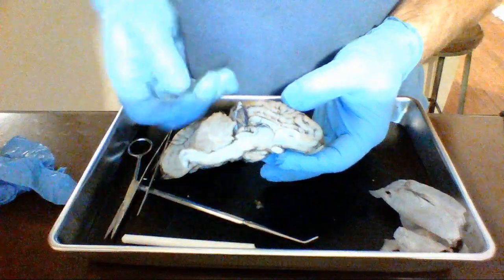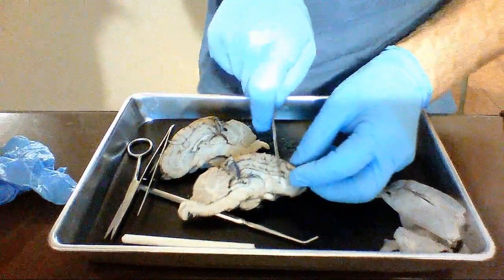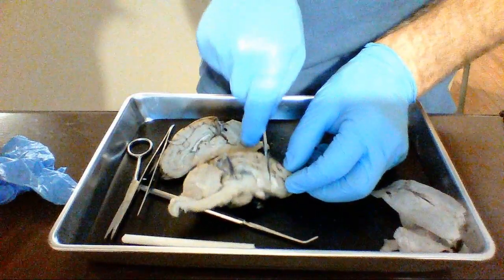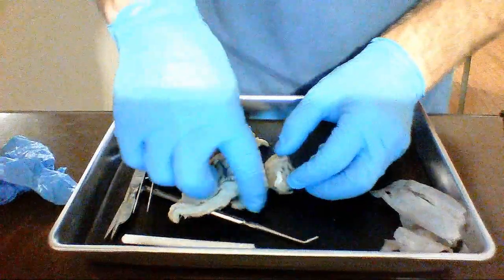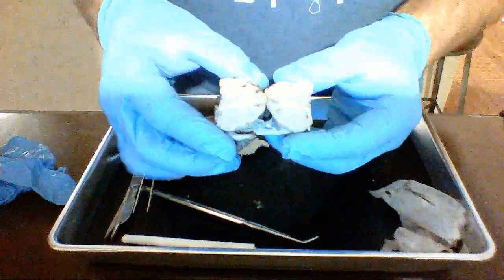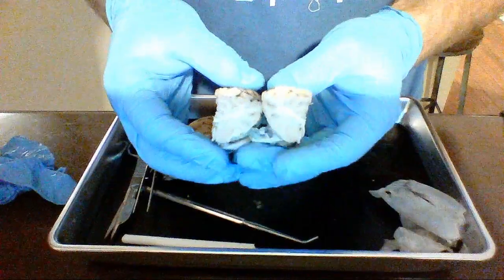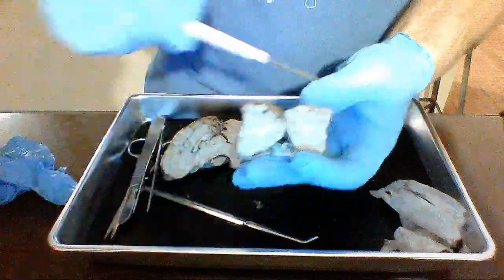And now the last cut we're going to make is a coronal cut or frontal cut, so that we can see the inside of that ventricle and we can see what the inside here looks like. So probably the most prominent feature you can see is there's some areas that are lighter in color, some that are darker. And the edges are dark.